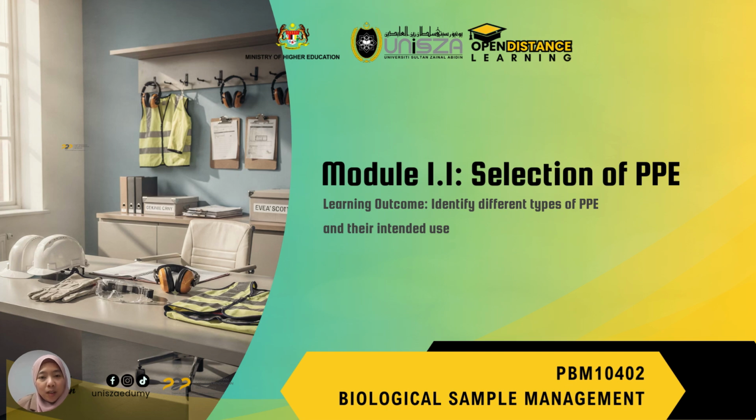Hello everyone, welcome to the Biological Sample Management module. In this video we will cover the selection of personal protective equipment, or PPE, and by the end of this session you should be able to identify different types of PPE and their intended use, as well as explain them in various work environments, especially in the laboratory setting.